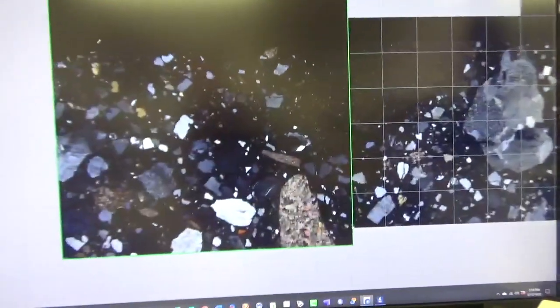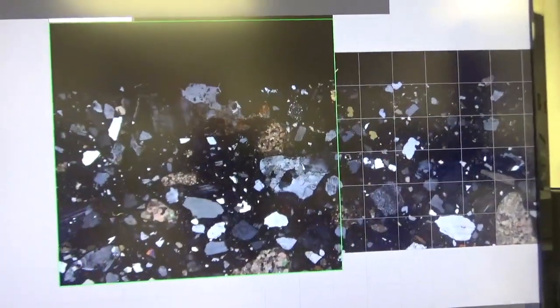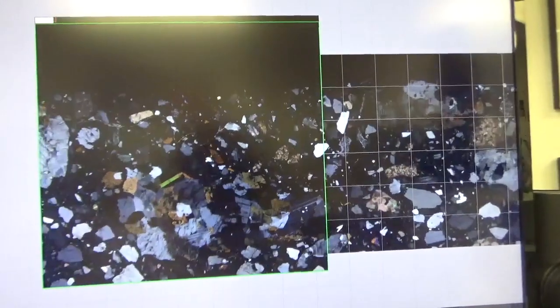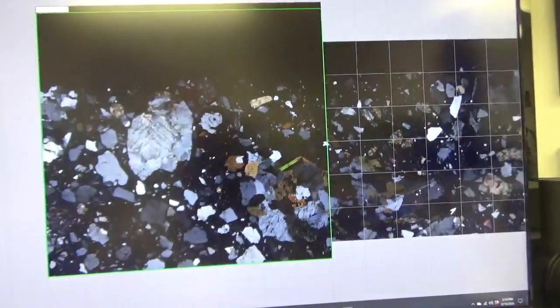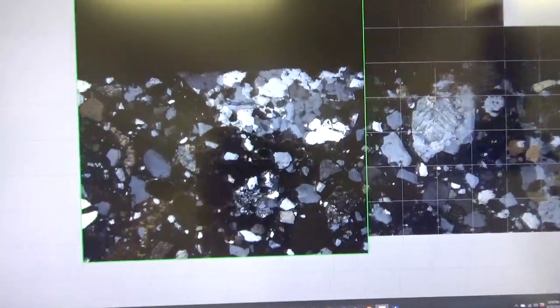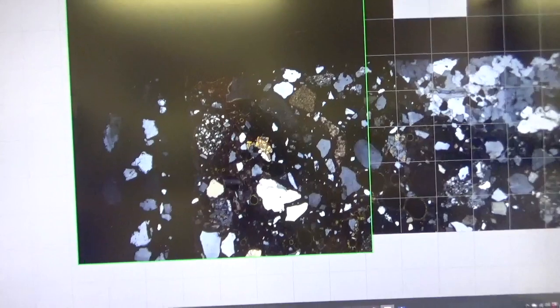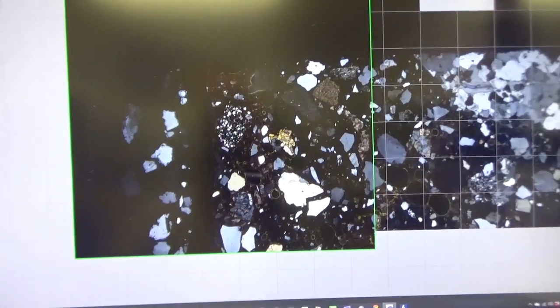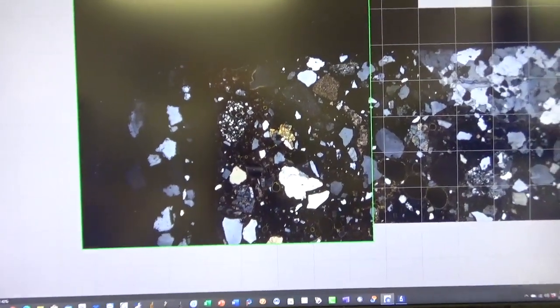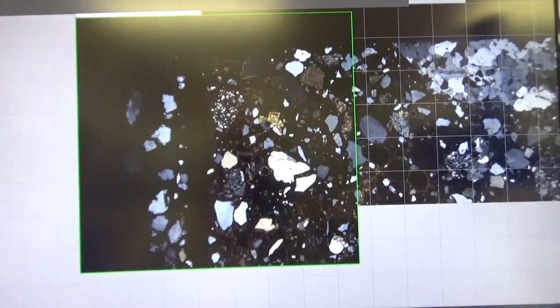In cross-polarized light, it is helpful to see the distribution of the coarse aggregate and the fine aggregate in the concrete, especially the siliceous aggregate and the calcareous aggregate, crushed limestone for example. In this case, there is granite in the coarse aggregate, and silica sand, feldspar, limestone and dolomite particles in the fine aggregate. All of those are clearly seen in the entire slide.